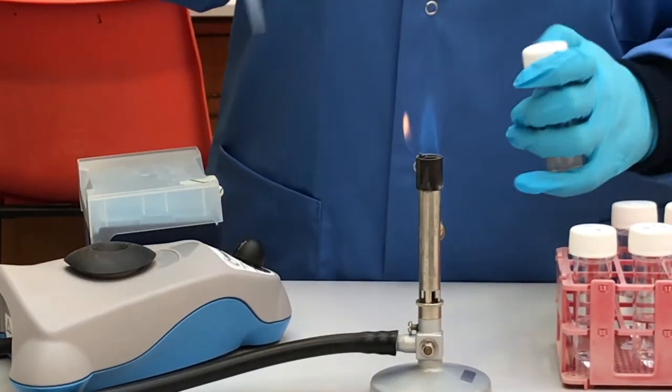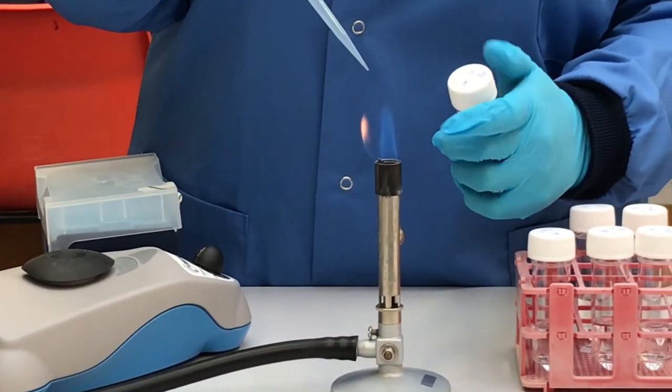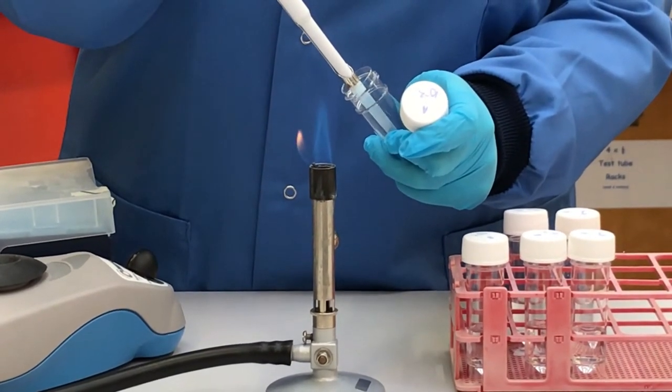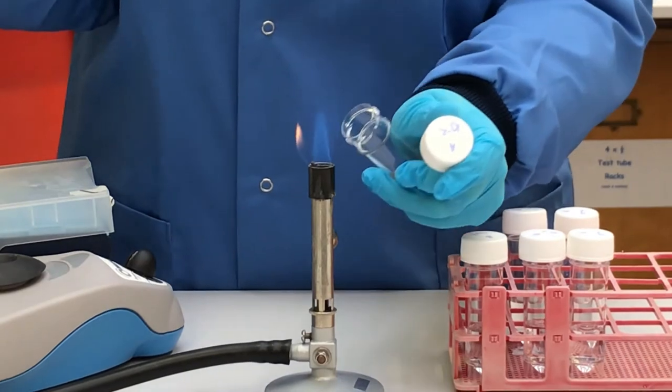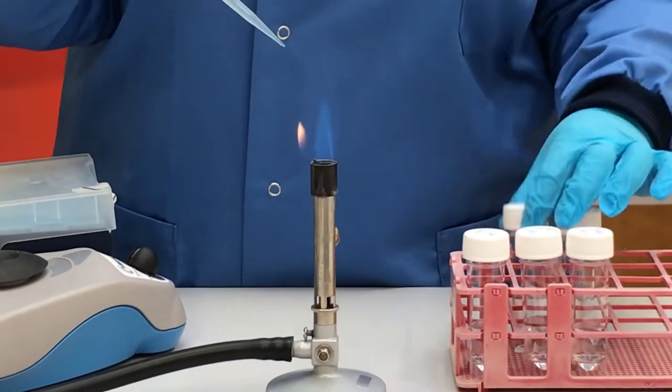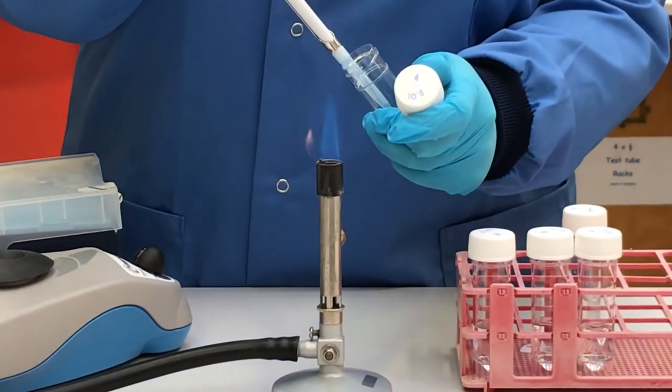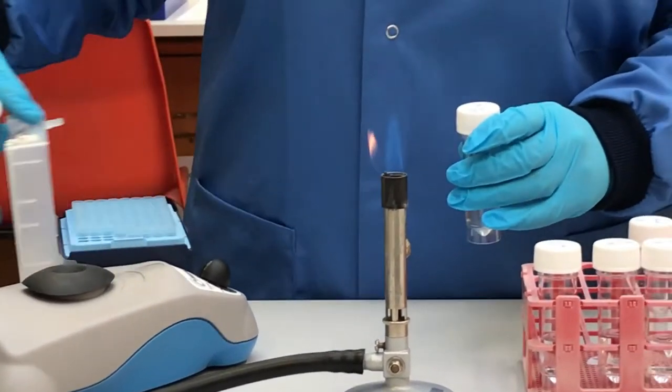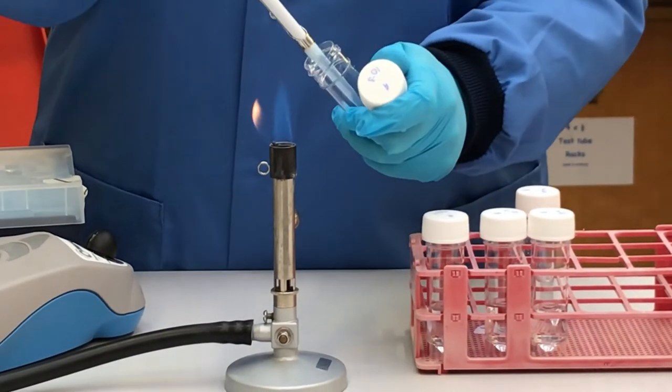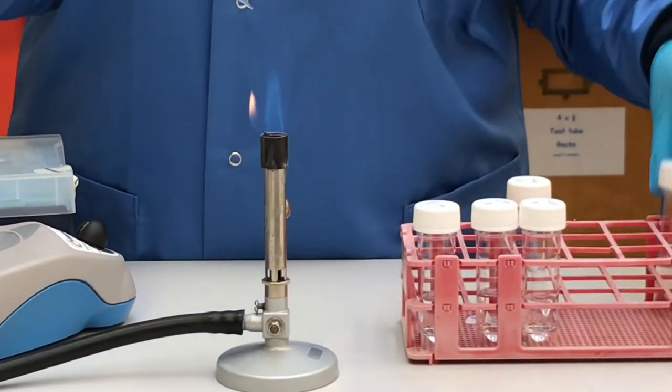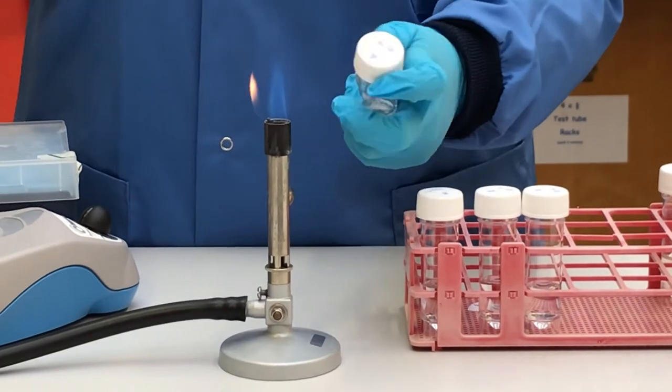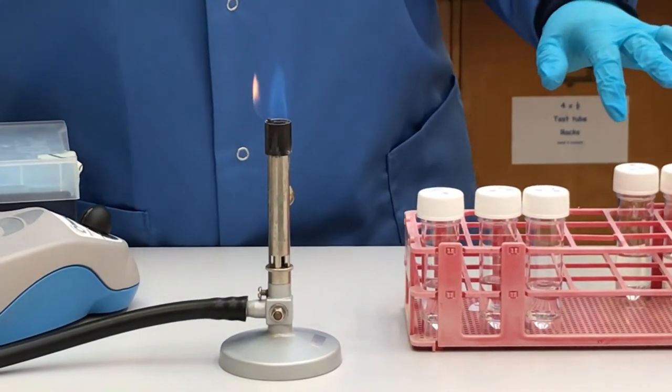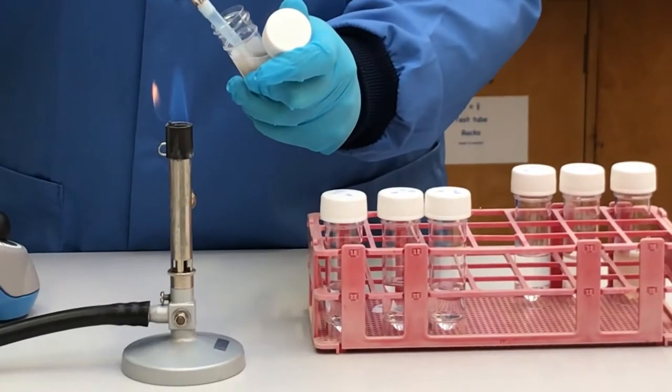This sample represents your minus 2 dilution and is used to prepare your minus 3 dilution using the same method as previously employed. Repeat this process for the 10 to the minus 4 dilution. Don't forget to vortex this sample. Repeat this process using Sample B.